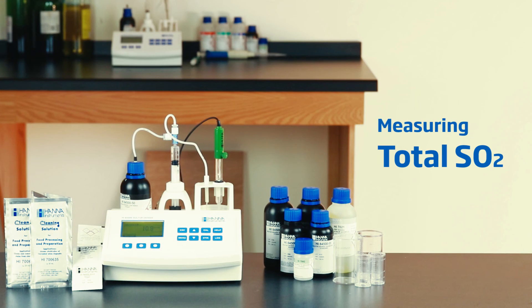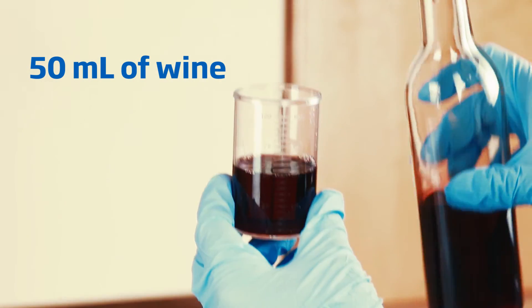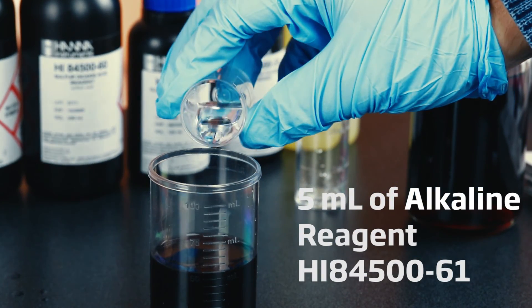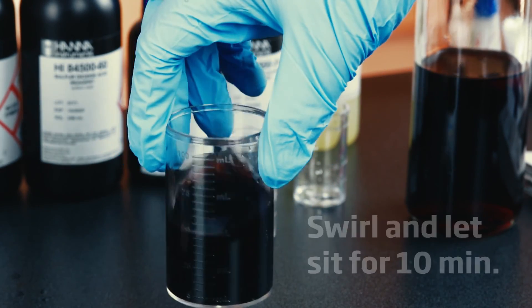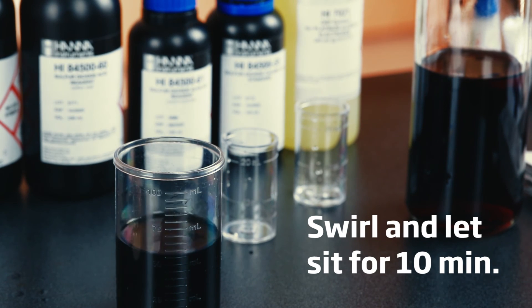Doing total SO2 is very similar but requires an additional reagent in the beginning. After 10 minutes you can add your acid reagent and stabilizer packet. Then you can titrate just like free SO2.